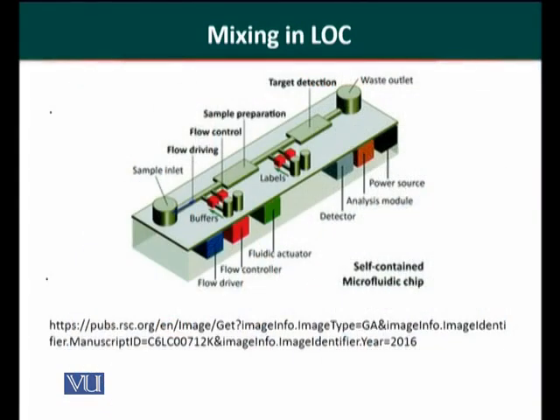You can see in this slide, this is a lab on chip for the PCR technology. Here you can see this slide is very elaborate, but we will only concentrate on the first two things, that is the flow driver and the flow controller. And these flow drivers and flow controllers are very helpful in driving the samples and reagents to mix together, and that could provide the result later on.